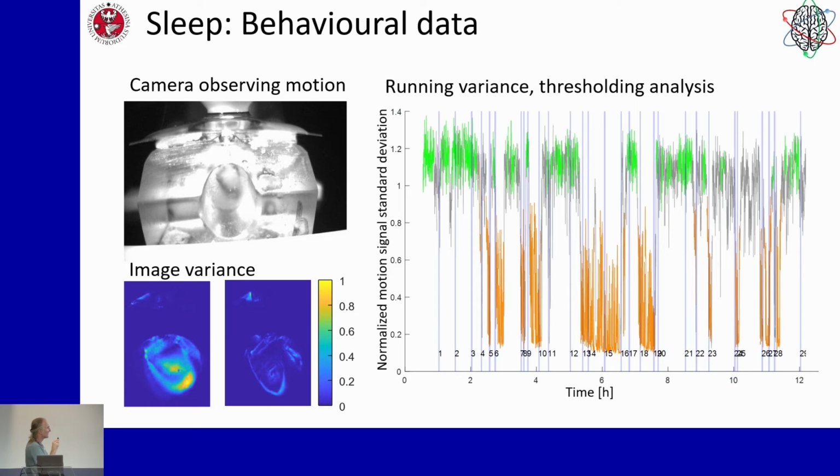So we have to automate our neural imaging, so we trigger our microscope whenever we detect a switching of the variance here, and we take images of 1 minute, and if we are lucky, then we have a night where we find samples from both of these states that we can then analyze.